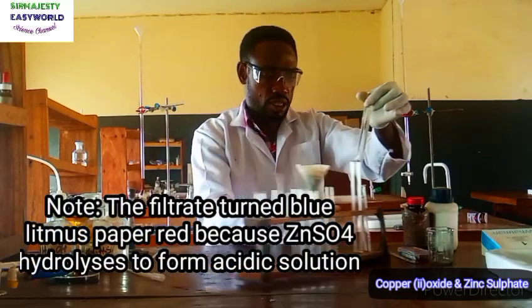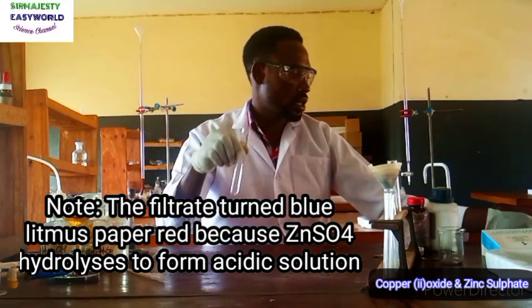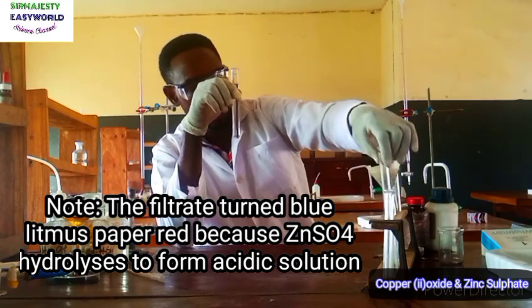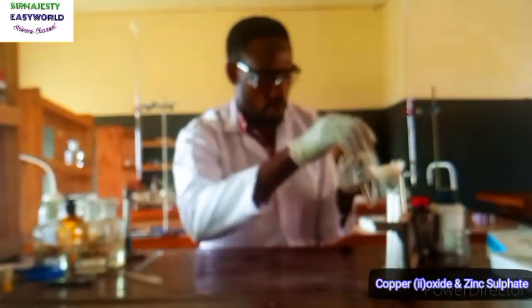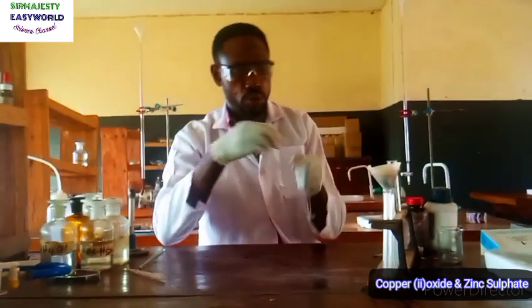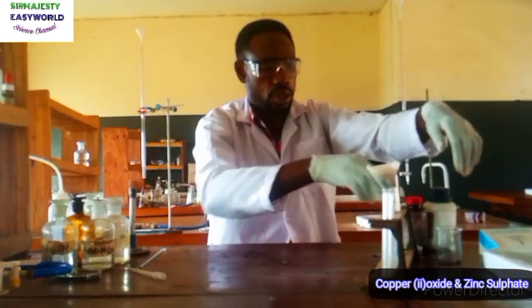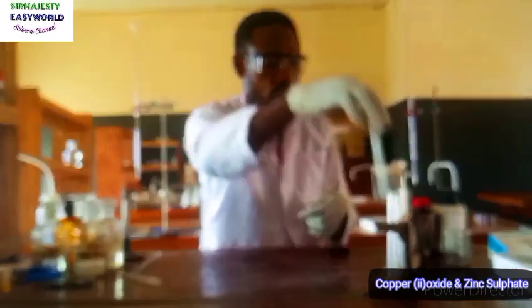So we take the next step, which says that we have to divide these filtrates into 3 equal parts. So here I have the test tubes. Any test tube you will use, you wash very well to avoid contamination of your results.